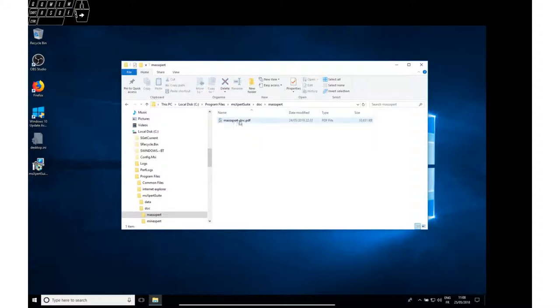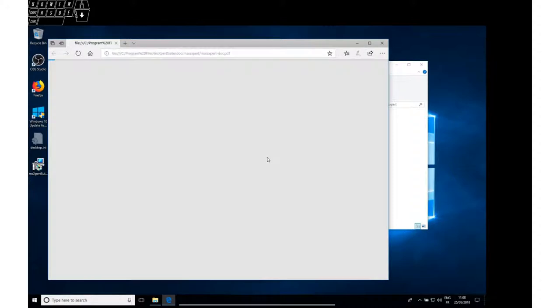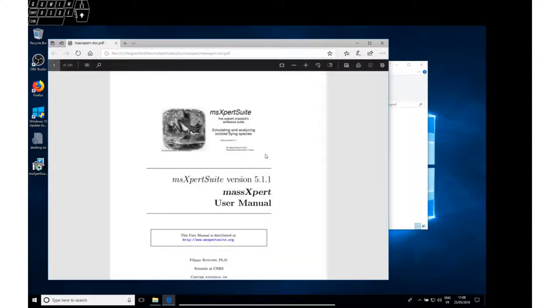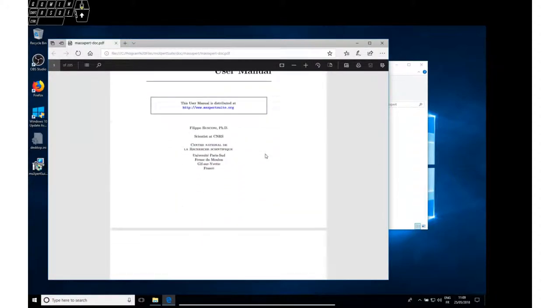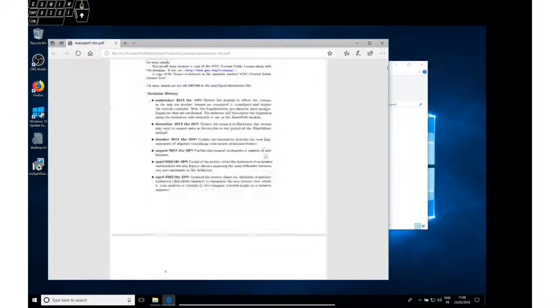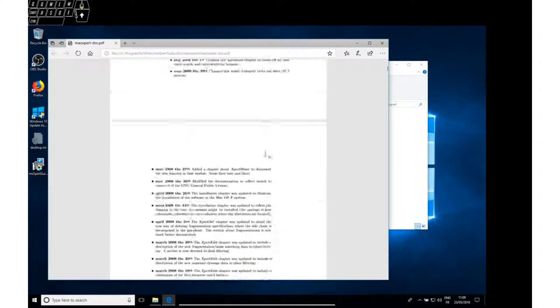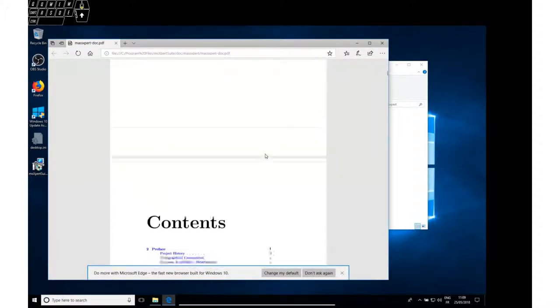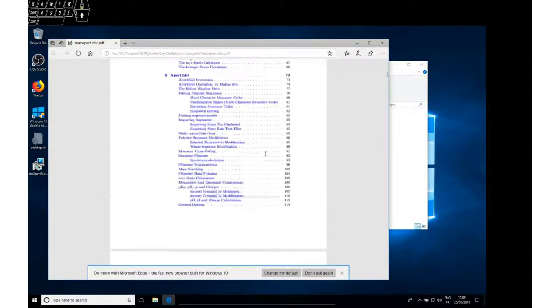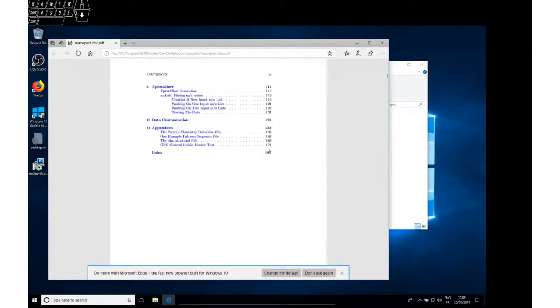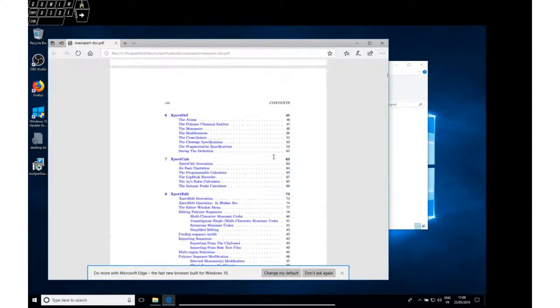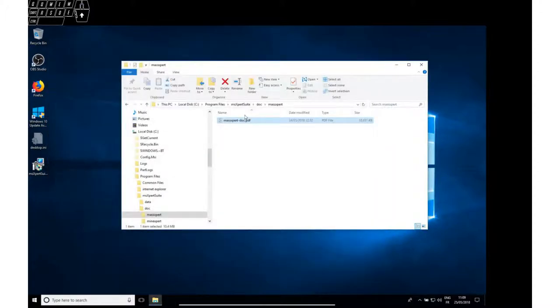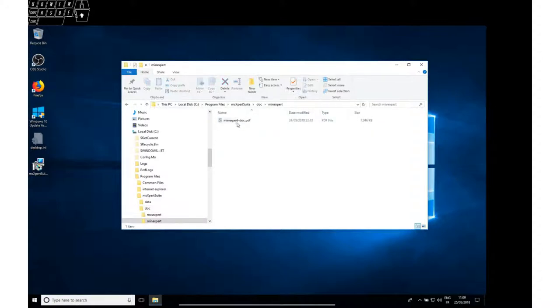The documentation for Mass Expert is very detailed. This must be something like 200 pages... 147 pages. And there is documentation also for the Mine Expert program.